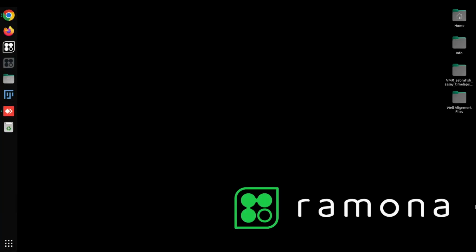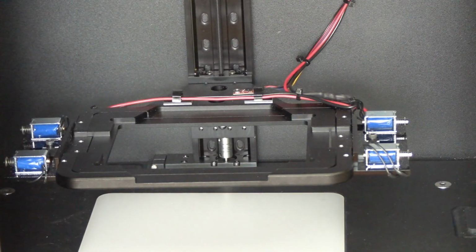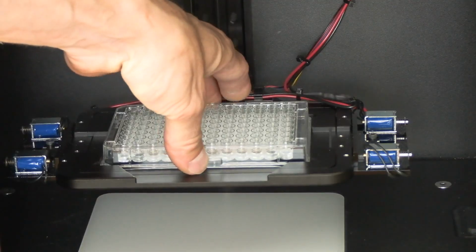In this tutorial we're going to walk through the steps to acquiring a XYZ stack with the multi-camera array microscope, also known as the MCAM. First, place your 96 well plate with zebrafish into the MCAM. Please make sure the well plate is oriented correctly so that well A1 is in the top left corner.